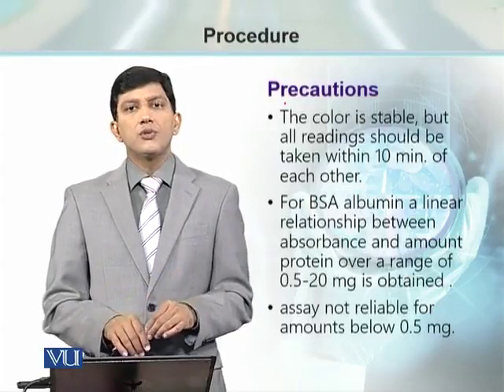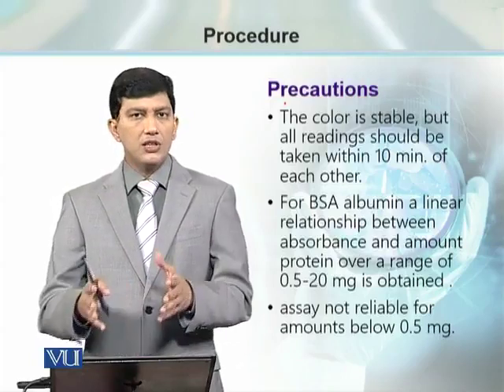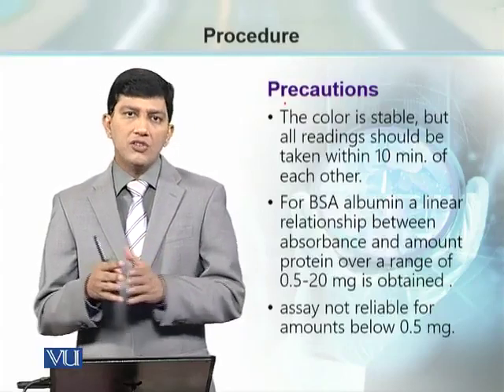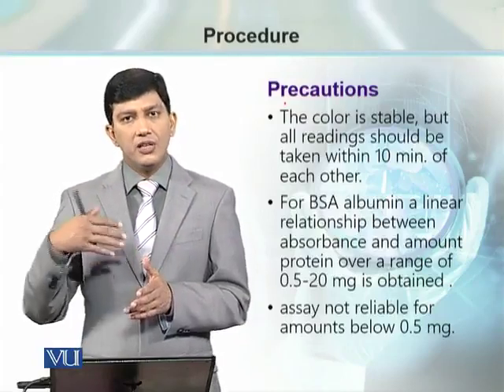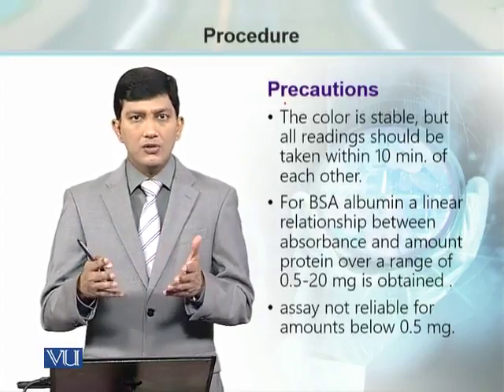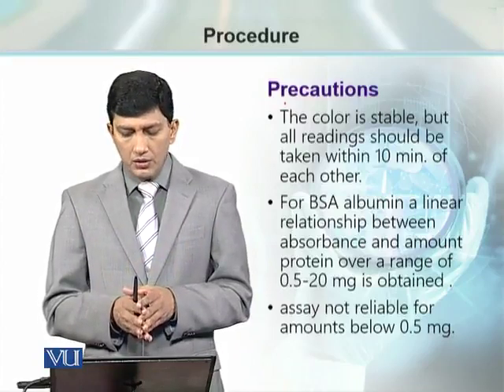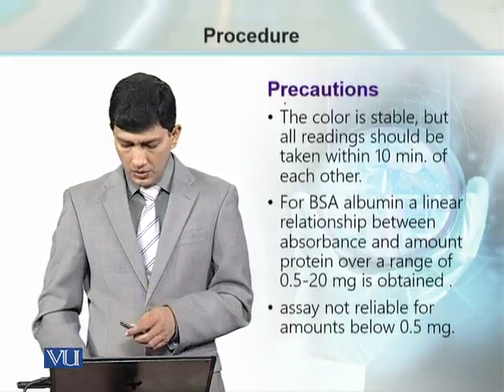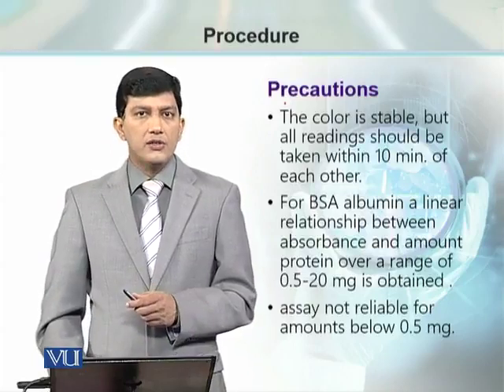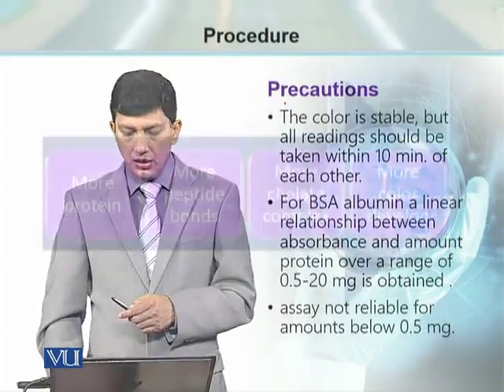इसमें एक और चीज़ का ख्याल रखना ज़रूरी होता है कि इंक्यूबेशन टाइम जो हमने अभी बात की कि 15 मिनट के लिए इसको रूम टेम्परेचर पे छोड़ दीजिए, 10 मिनट के लिए इसको रूम टेम्परेचर पे छोड़ दीजिए. टाइम शुड बी 10 to 15 मिनट्स. इसको इससे ज़्यादा प्रोलॉन्ग करने से कलर इंटेंसिटी वेरी करती रहती है, और उसके बाद जो रिजल्ट्स हैं they could not be reliable because of any kind of error that comes in those particular tubes. This assay is not reliable for any sample which has a concentration of less than 0.5 milligram per milliliter.